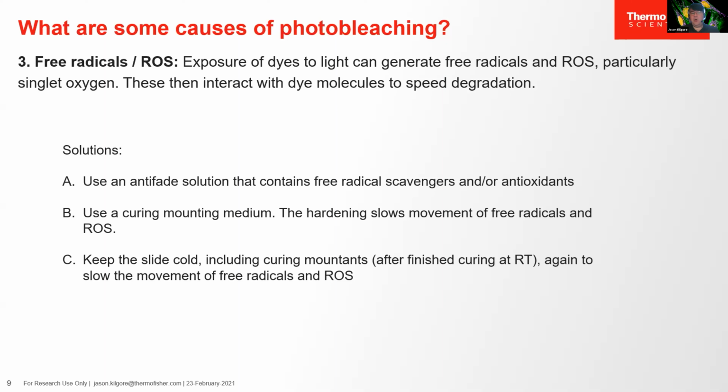Keeping your samples cold can reduce the kinetics as well. So if you're using a hardening mounting medium, once it has cured at room temperature, after a day or so, then you can store your slides at 4 degrees or even -20 to slow the off rate of your sample, but also to reduce the kinetics of the movement of that ROS species.